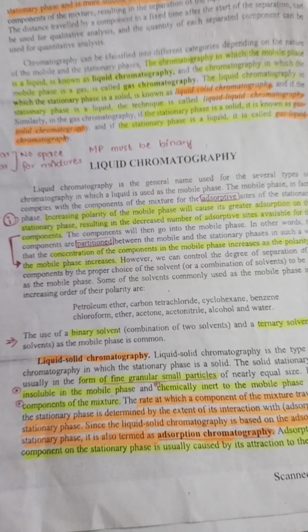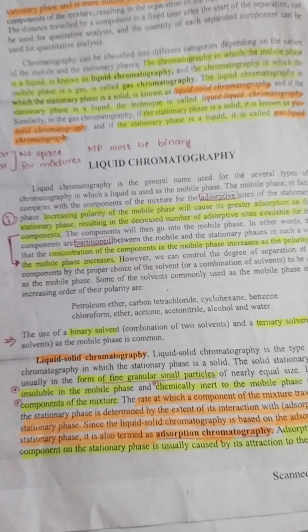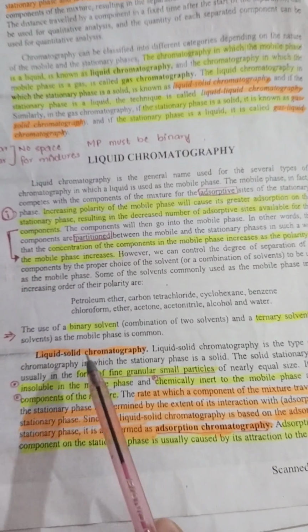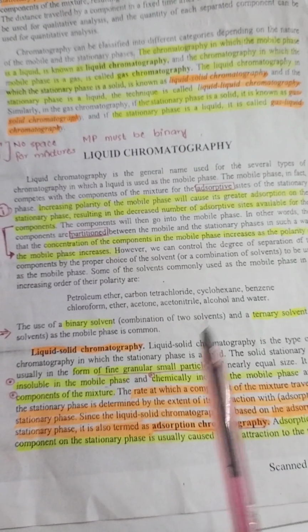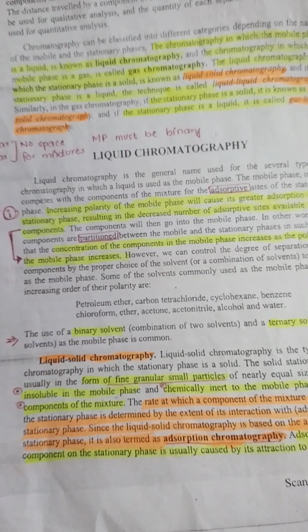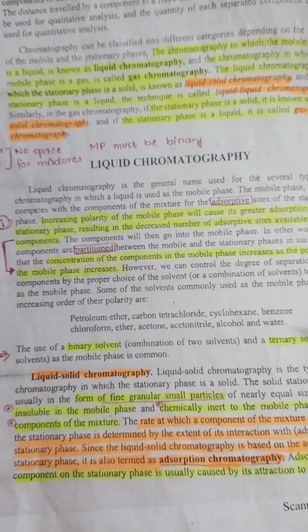And now we categorize it into two parts: liquid-liquid chromatography and liquid-solid chromatography. In liquid-solid chromatography, the stationary phase is solid. And in liquid-liquid chromatography, the stationary phase is liquid. Now, before going to its categories, first we discuss liquid chromatography.